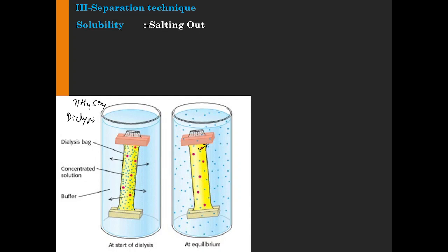There are certain centricons, as they are called, which have preferential pore sizes that can hold your proteins, and one can use centrifugal force, because dialysis sometimes takes more time. People also use that even to concentrate the protein.